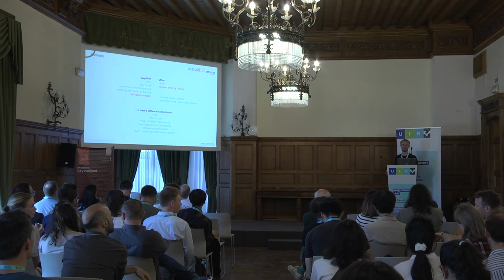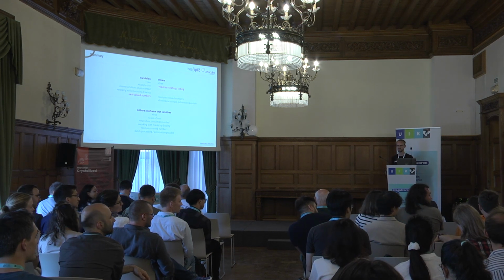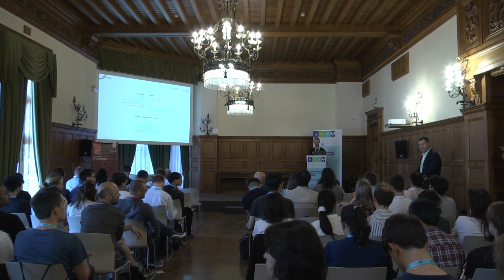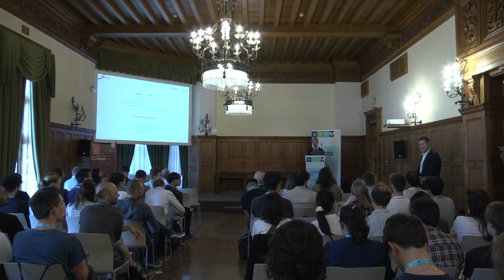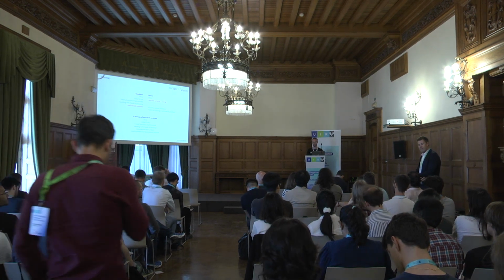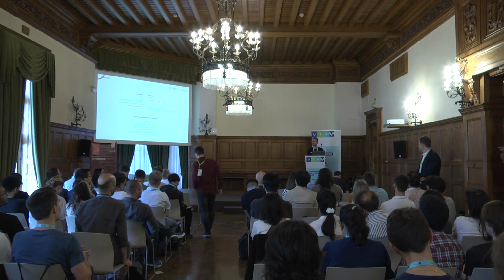Thank you, Lars. Are there any questions? Yes. Hi. So my question is, to remove your polynomial background, you choose vertical and of the order of 1. So any specific, how do you choose? Like, we should choose order 1 or 2, 1 or 3 or 5. So what is the criteria?